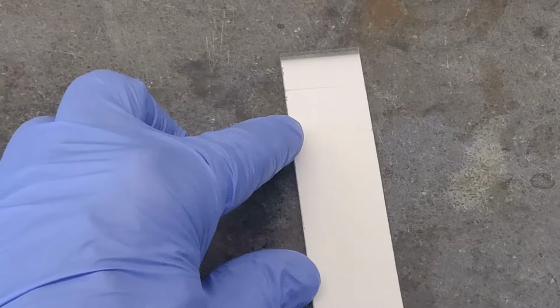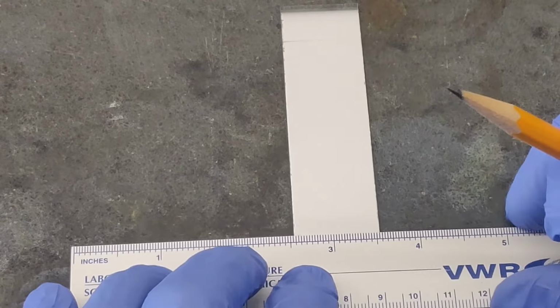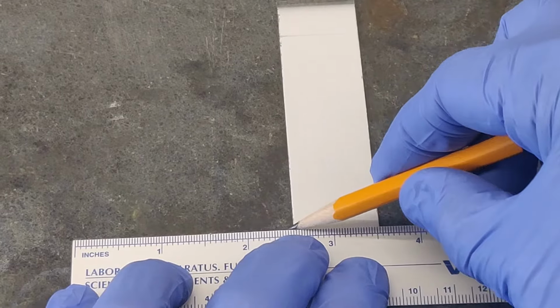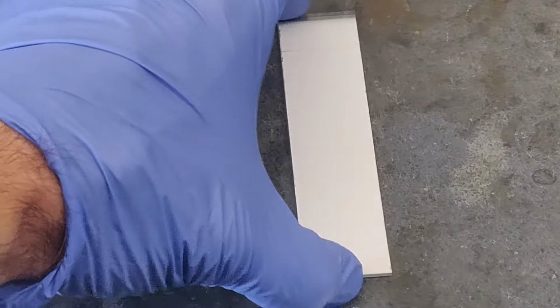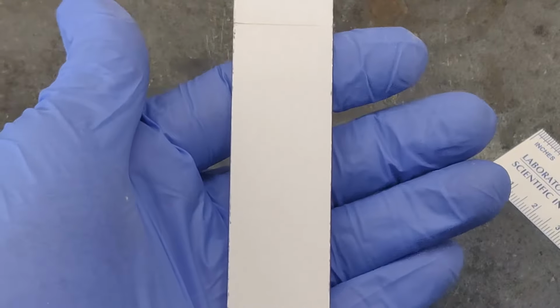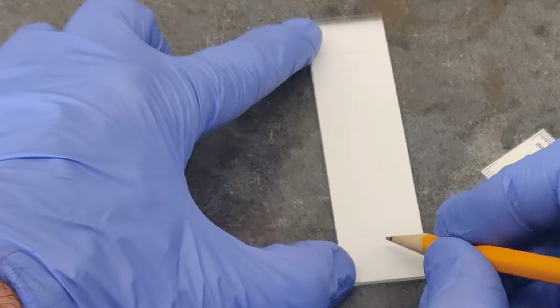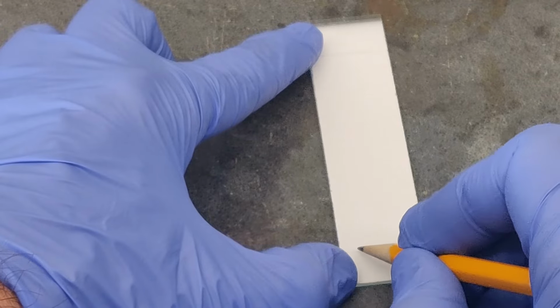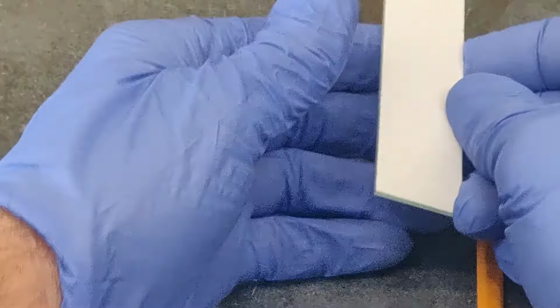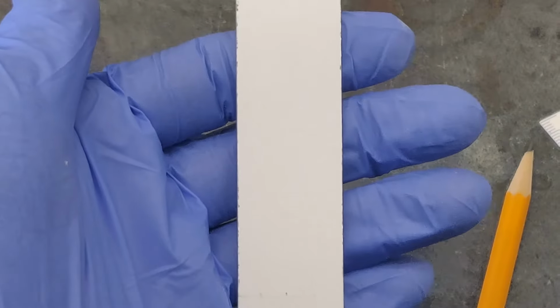From the other end, use a ruler to lightly draw a pencil line 1 centimeter from the very edge of the plate. This line will serve to mark the origin along which you will spot the plate. Along the origin, very lightly make 3 small marks equidistant from each other and from the edges of the plate. The TLC plate is now ready for spotting.